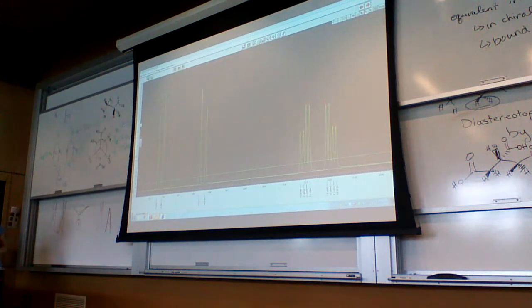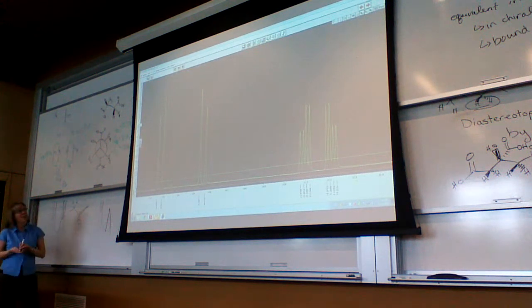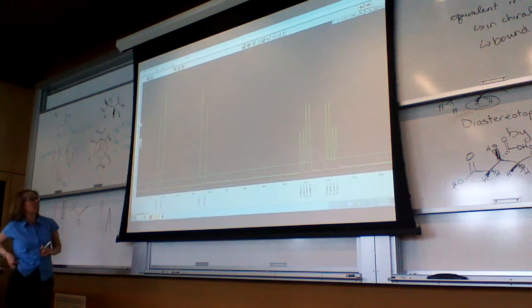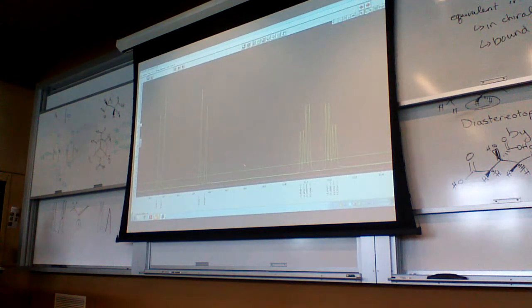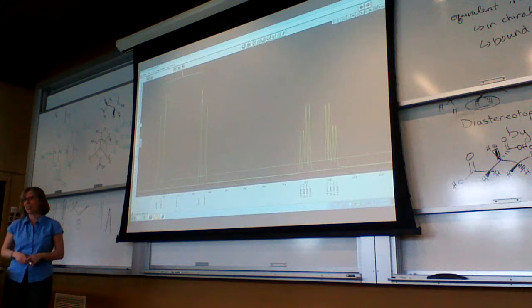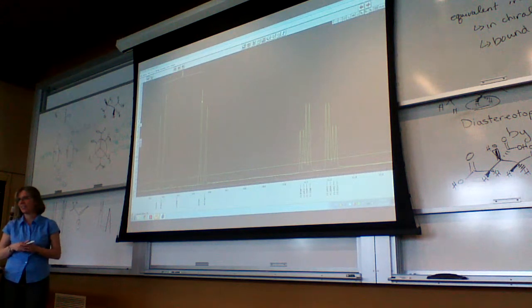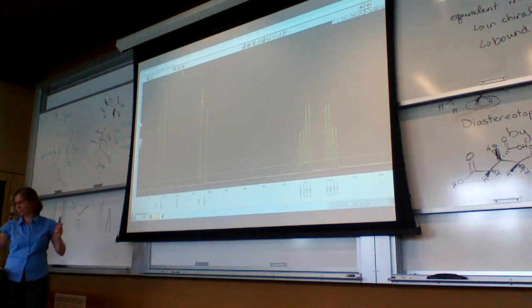We were looking at that one. We don't really see coupling constants quite that major. If we went from here to here, 143, that would be okay for a 1-bond coupling. We talked about that, but nothing larger than that. And you don't have HH 1-bond couplings unless you have hydrogen gas. So that's not a problem, but that would be way too big.